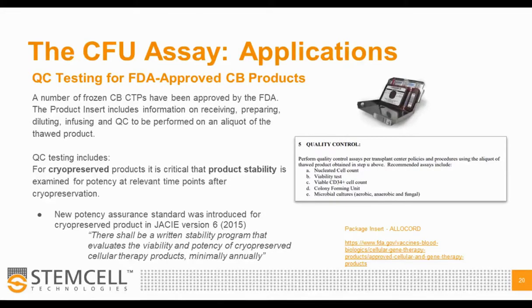This is really important: you put in temperature monitoring systems when you're shipping cells, and it's actually up to the cord blood bank, as you noticed in the other guidances, to ensure that they've looked pre and post-thaw, that they have hematopoietic stem and progenitor cells that are actually going to grow out, and they use the CFU assay or analogous potency assay, but they recommend the CFU to ensure that that's the case.